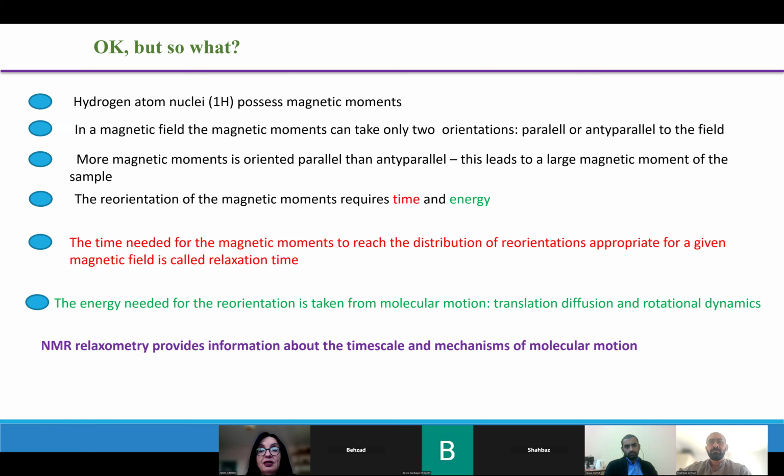But then you can ask, okay, but what about the lattice, the molecules, what kind of energy do they have? Because they move. And now you can ask the next question, why do molecules and objects move? Here again, I can refer you to high school physics and the concept of temperature.